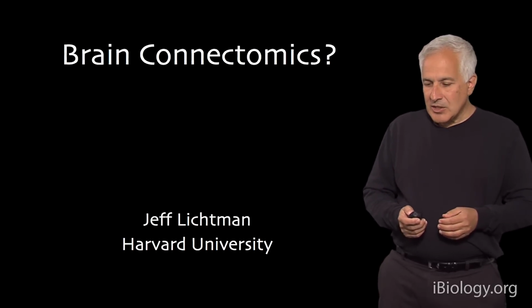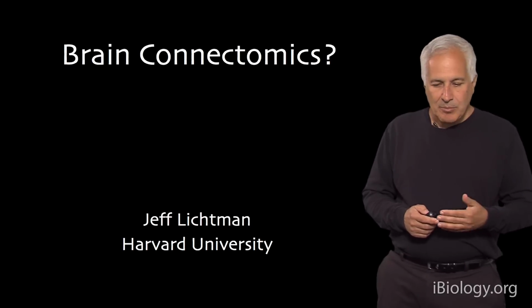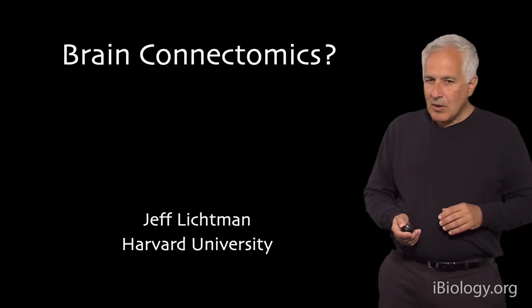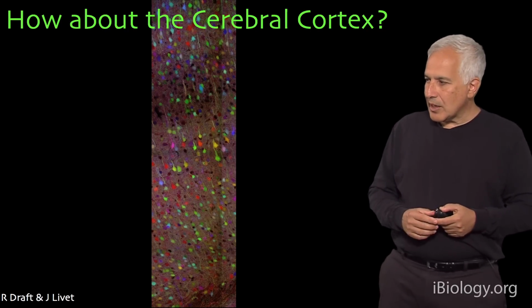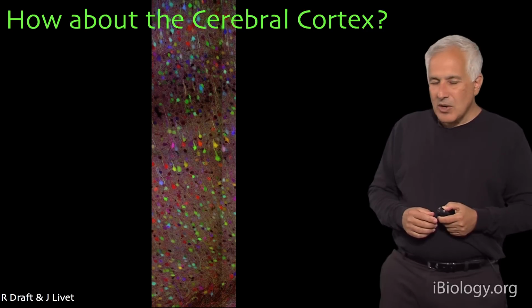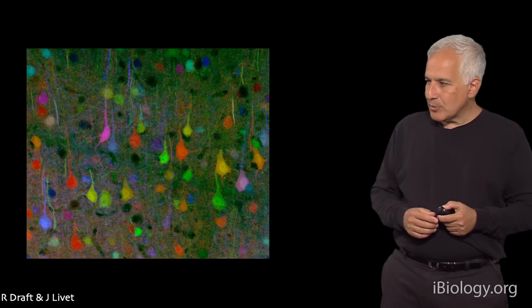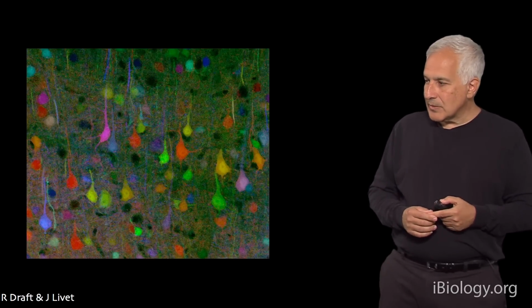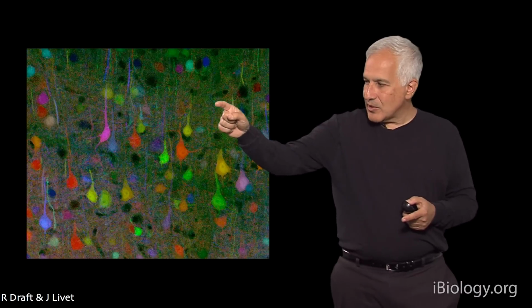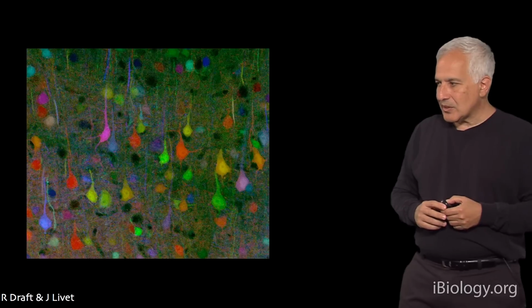It's a challenge because the tools that we had previously developed, these tools that are called Brainbow, where each nerve cell is labeled a different color, although they provide very nice-looking pictures of the brain, this is cerebral cortex, for example, it is hard to deal with the tracing of wires. If we zoom up on a small part of this piece of brain, this is sort of a technicolor Golgi. That is, the cells are many different colors. But what really matters is not the color of the cells, it's the felt work, this fine stuff in between the cells, whether we can trace out those wires to see how one cell is connected to another.